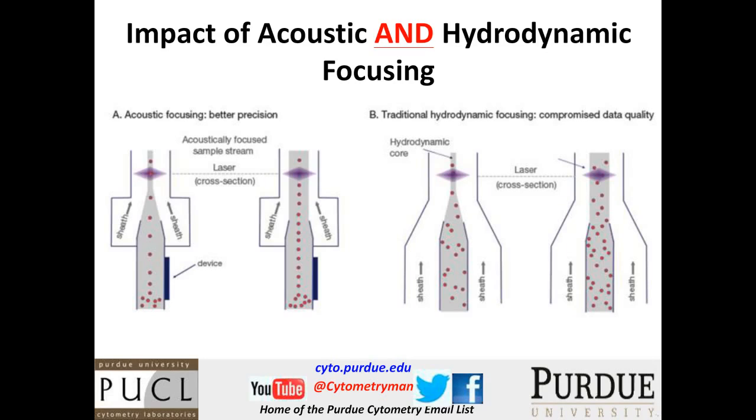And what Greg discovered is when you put the two systems together, that is, you have both the hydrodynamic focusing and the acoustic focusing, you get the best of both worlds. Now, you probably can get away without hydrodynamic focusing, which is true because you do this in many of the commercial instruments that are out there which don't have this technology.